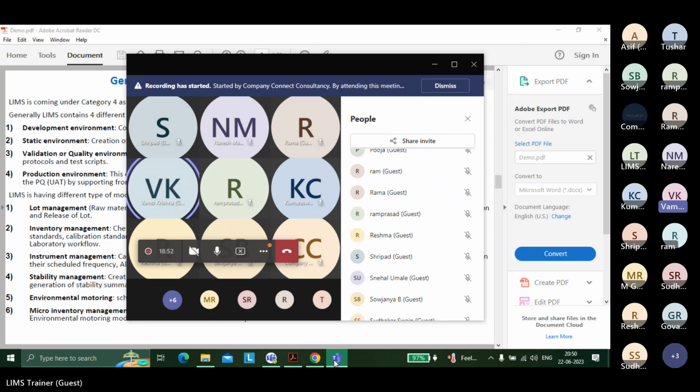He can ask many questions and we can crack whatever the developer is giving. Even if you are QA, you need some details: who logged in when, who did what, which samples were logged in. If I tell you that I want all the samples which are in unreceived status, then you can write one simple query where status is unreceived, which will make your task very easy. Instead of going into a report and pulling, just one line of query.